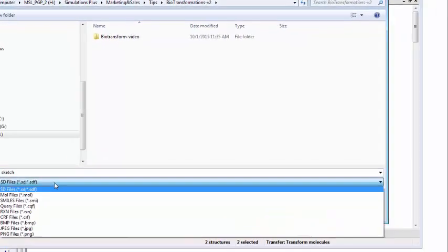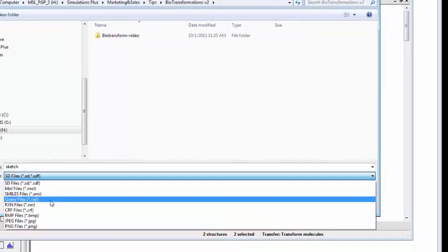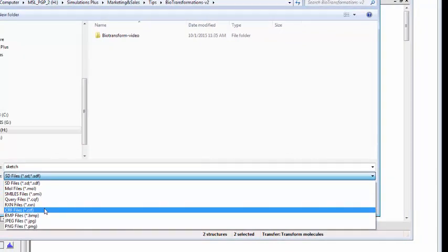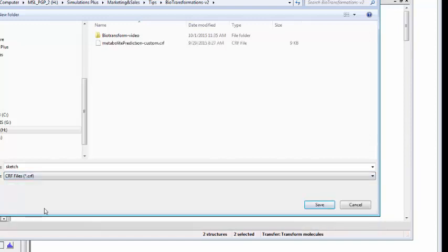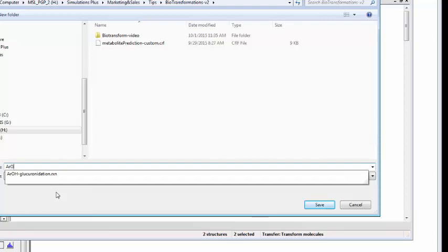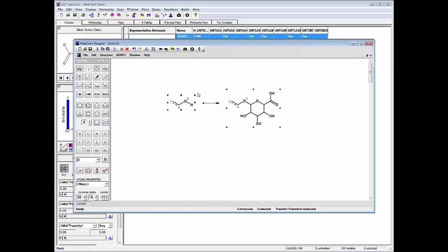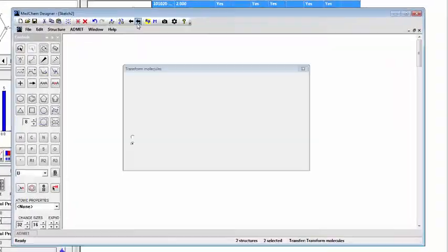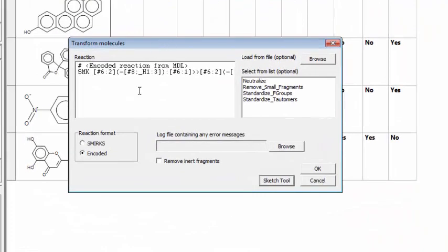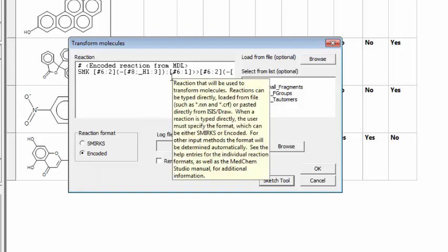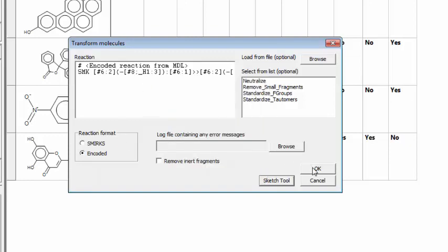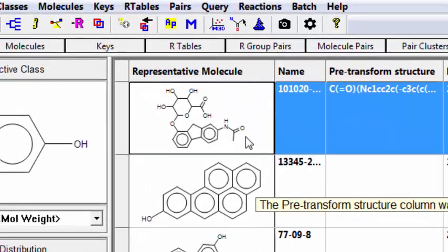So here's where I can choose my file format. I'm going to choose the CRF file. One could also save it as a reaction file. This could be read into the other drawing packages. Or we could have started with the other drawing package, specified the reaction, copied that to the clipboard, and then transferred it here. I'm going to give this a reasonable name. I'm going to call it AROH-Glucuronidation and hit return. So that's created the CRF file. I transfer that back into the dialog box and that's encoded as a smirk string. Then I simply click OK and it transforms the product.